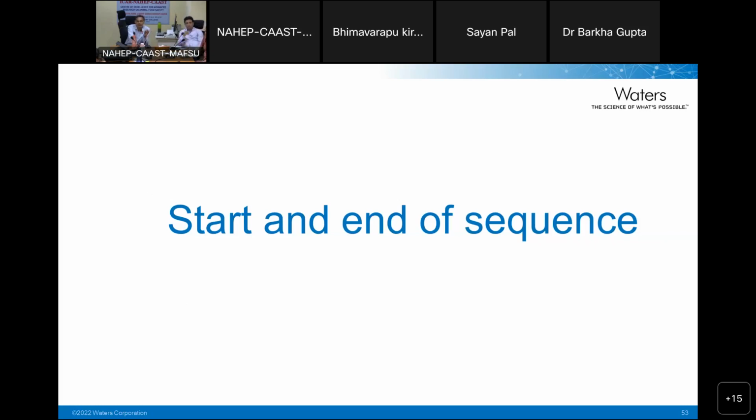That has to be cleaned periodically, or that could lead to sensitivity issues. There is again no thumb rule; it depends on your usage, your type of analysis, and the mobile phase that you are using. But yes, at least once a week is good enough to clean that.